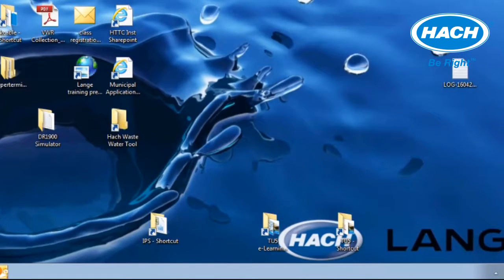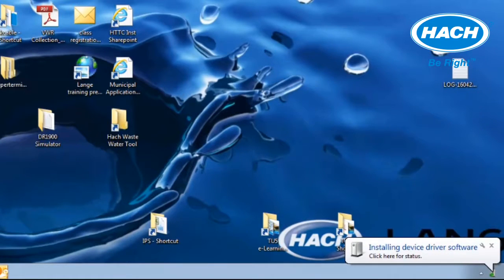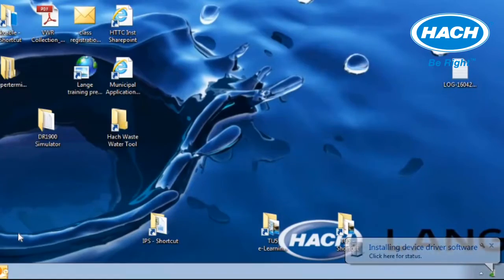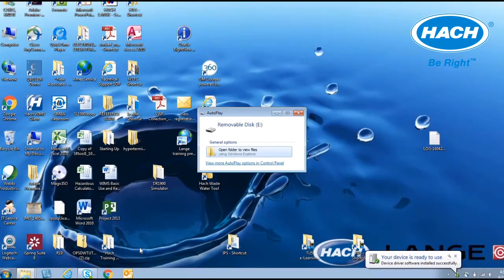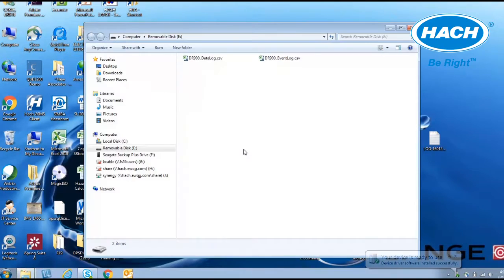If this is the first time the meter is connected to this PC, it will indicate that it is installing device driver software and then will notify that the installation was complete and ready to use. The PC will show a removable disk and a drive with the prompt to open folder to view files. If this prompt was not visible, then the drive can be located under My Computer.